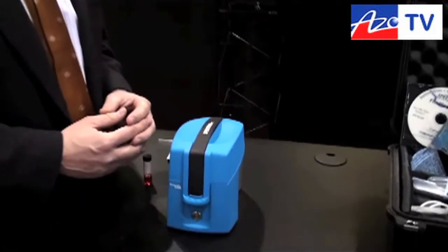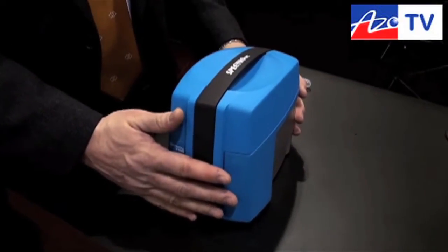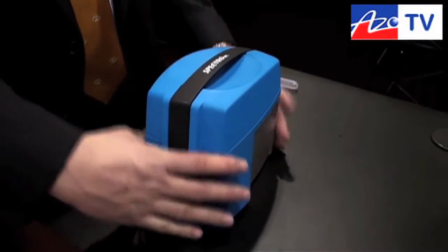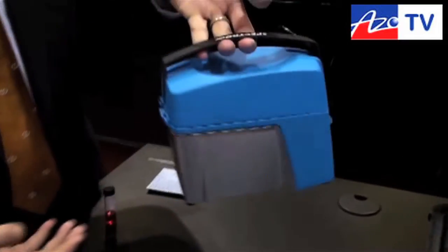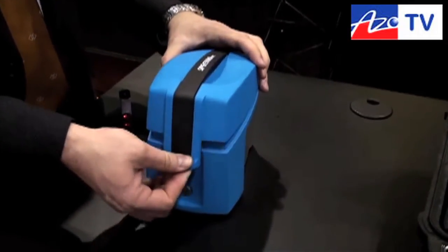This is Cameron Chai from azoom.com bringing you another episode of AzoTV. Today we're speaking to Dan Walsh from Spectro Inc, and he's going to show us their SpectroVisc Q3000 Kinematic Viscometer. Thank you, Cam. I'm very pleased to show everybody our latest product introduction, introduced just in October of last year. This is the world's most portable kinematic viscometer — a very simple portable system, designed and handled very easily so you can bring it anywhere on a job site.